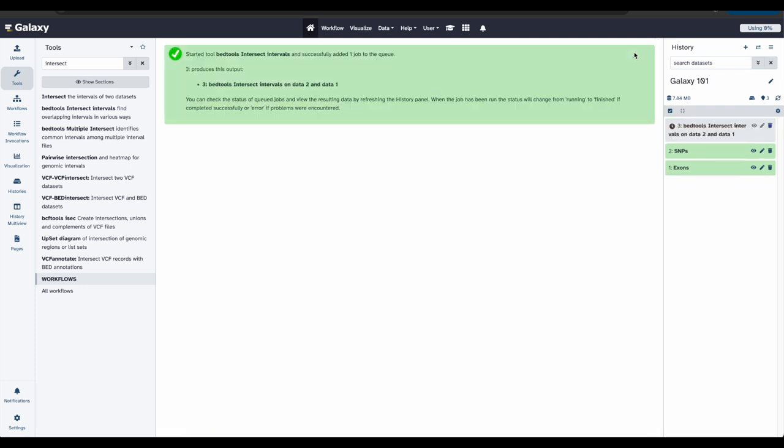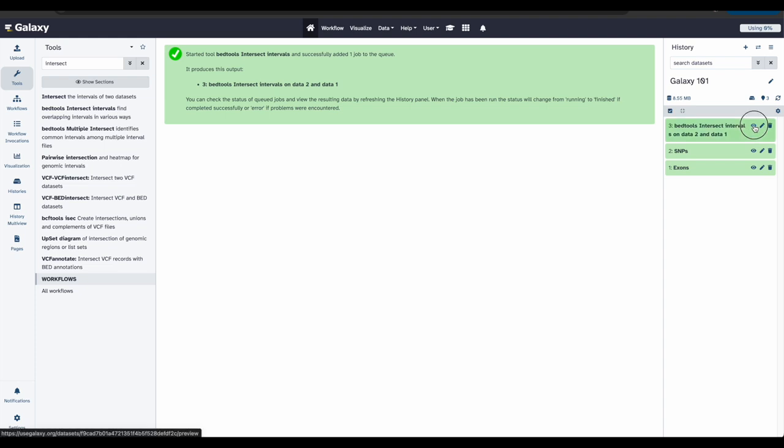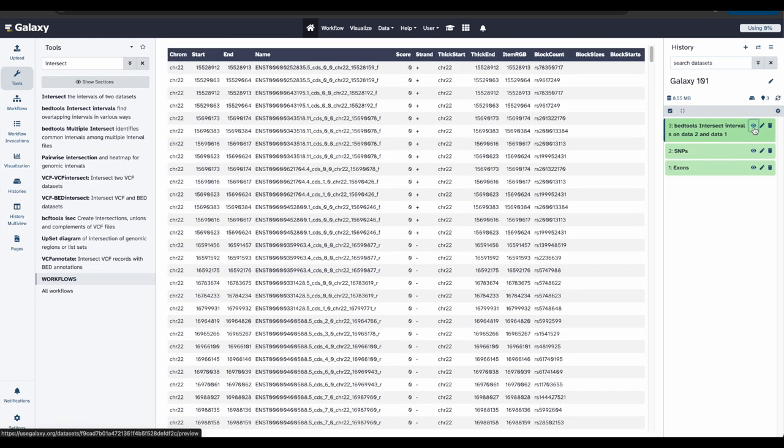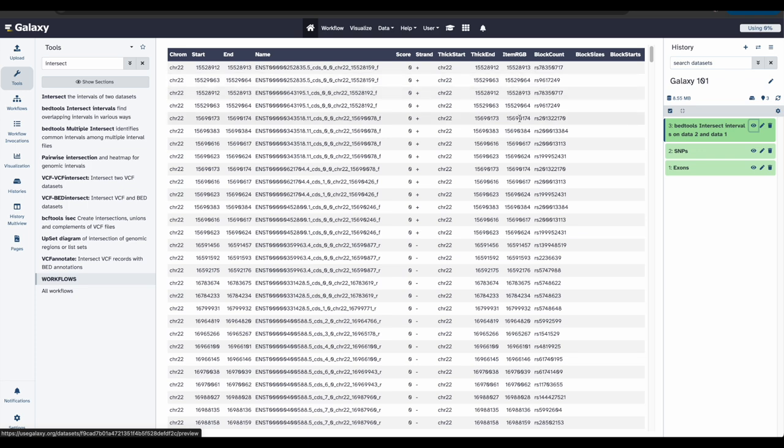Now, you can see Galaxy running the tool in the history. Once the job has finished running, we can view the results by clicking on the eye icon. If everything went okay, you should see a file that looks similar to this. Since each line in our file represents a single overlap between a snip and exon, we can find the total number of unique snip IDs per exon.